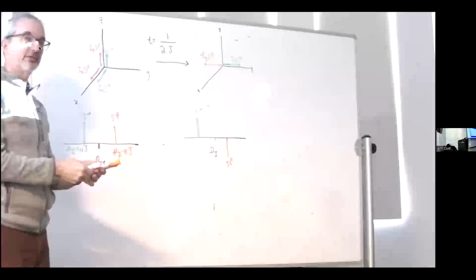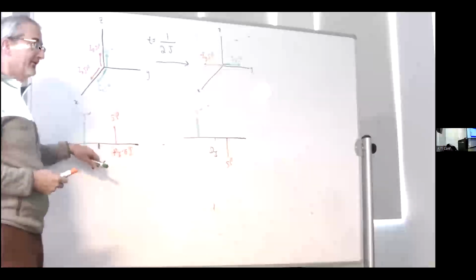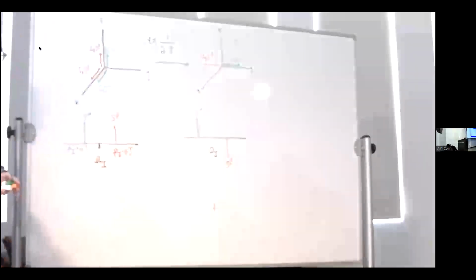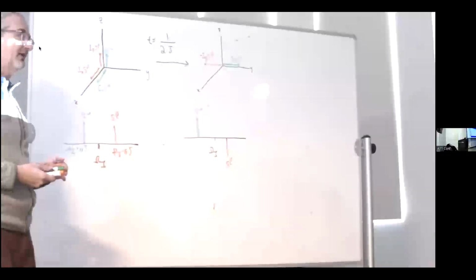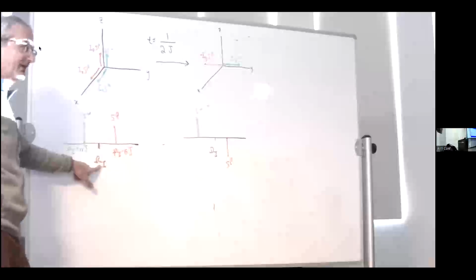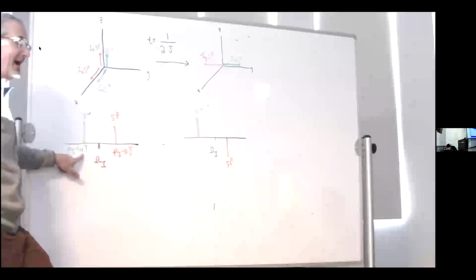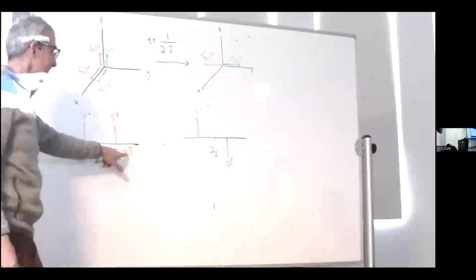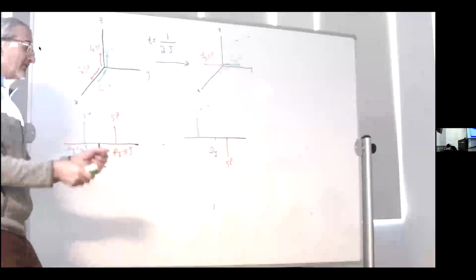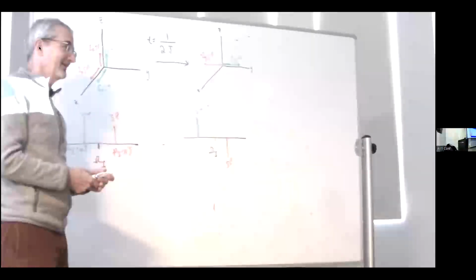And if I turn on the receiver, I'm going to see the usual in-phase doublet that you're used to seeing, in which the two lines are separated by 2 pi J in angular units or J in frequency units. And that means relative to the chemical shift of the I spin, one doublet component has a frequency upshifted by pi J, and the other doublet component is downshifted by pi J. This all depends on, of course, the sign of J, so these can swap around, but that doesn't affect the argument that I want to make.